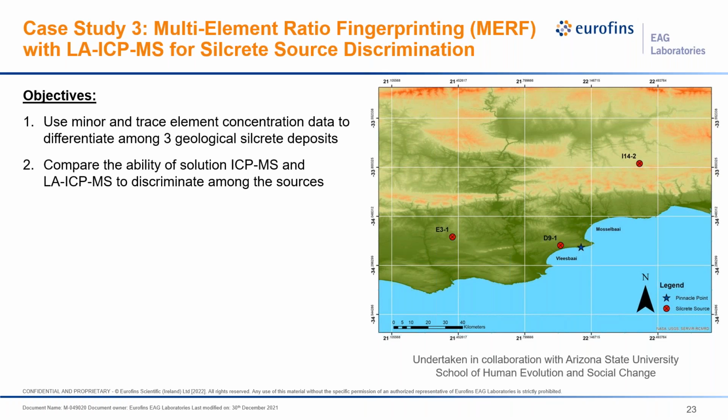So the goal here is provenience. How do you chemically differentiate among the rock deposits that ancient people used to make stone tools, and then figure out where the raw material for those tools was originally mined? So as an archaeologist and a geochemist, this is pretty exciting stuff. But also, as a chemist, it's a method development problem.